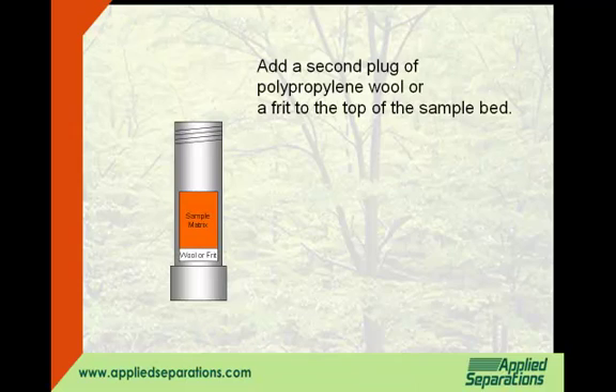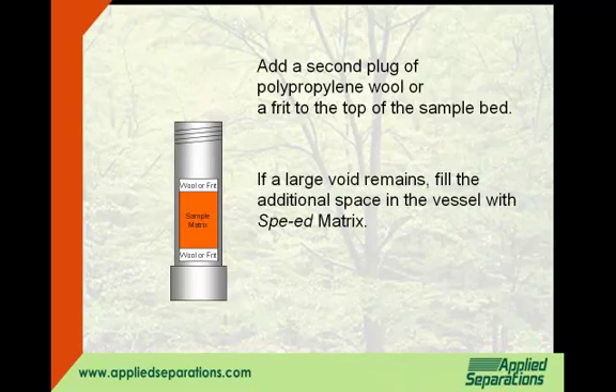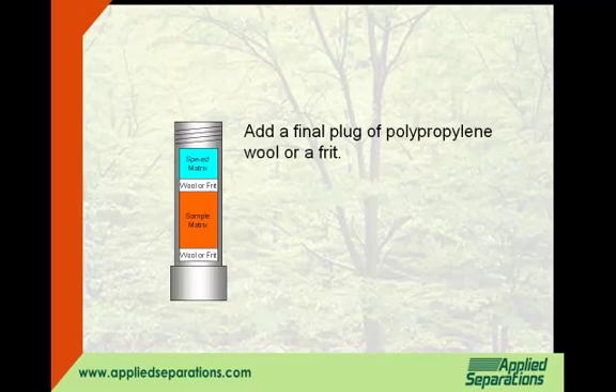Add a second plug of polypropylene wool or a frit to the top of the sample bed. If a large void remains, fill the additional space in the vessel with speed matrix. Add a final plug of polypropylene wool or a frit.